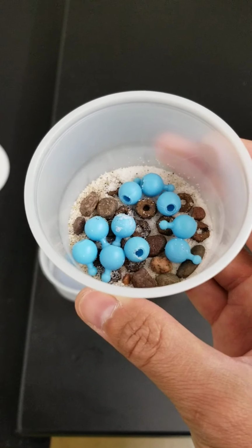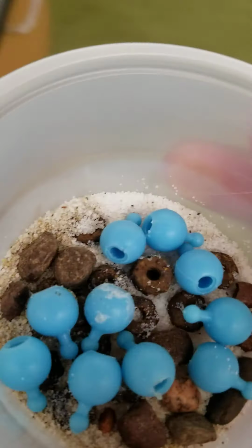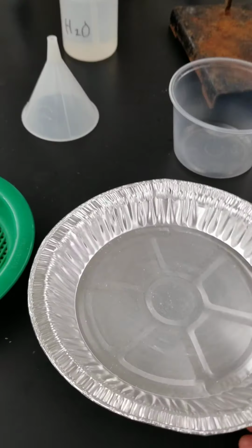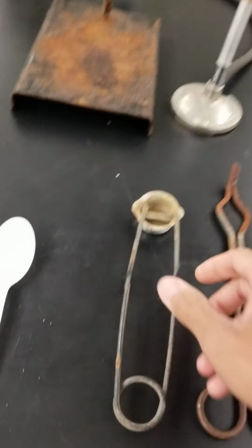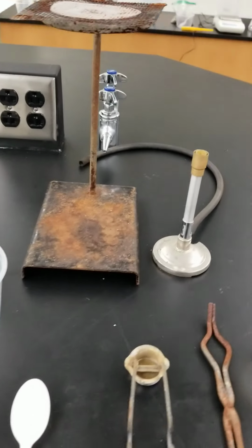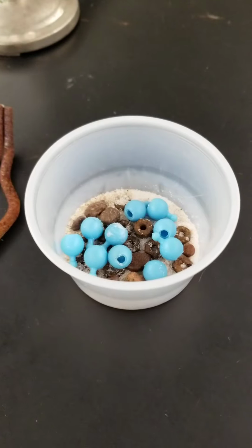Your task from here on is to design an experiment using the list of materials on your handout. I can show you the visual of those materials. What is available for us: we have filter paper, a plastic sifter, an aluminum pan, a plastic container, a funnel, some water, and a plastic spoon. We could light up our setup here with the Bunsen burner, it's a pretty limited set of resources, and we could even add some beakers if necessary. But the goal is to design an experiment that will separate these 5 materials.